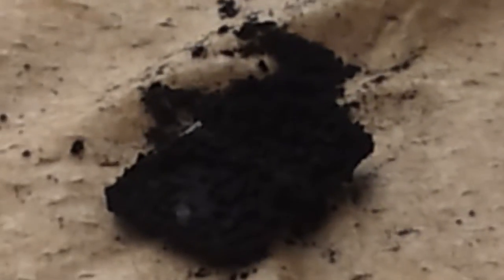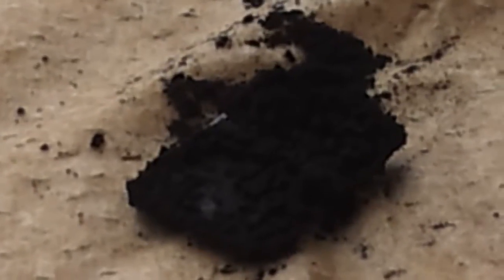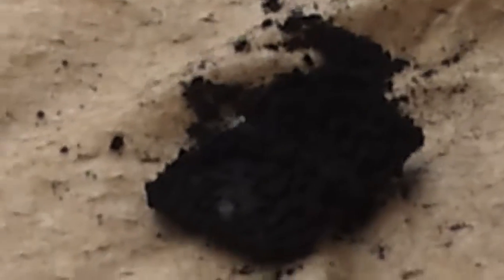Then we have our zinc. This one was our second most reactive. This one got left overnight and it's done this. It's precipitated, rusted, and formed an oxide. Yeah, that's what forming an oxide is, David. Oh. Rusting. It completely drew everything out of the solution and put it somewhere into this precipitate. So yeah, this is it.